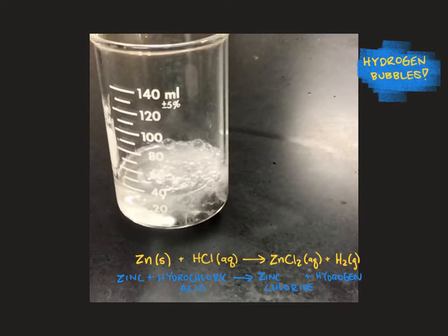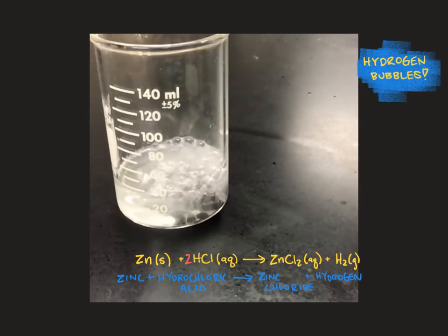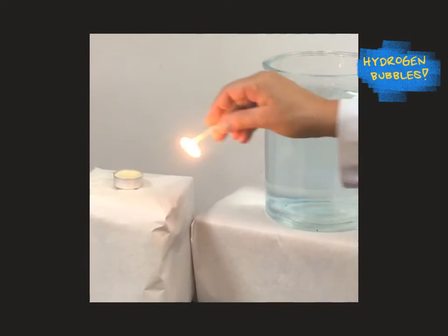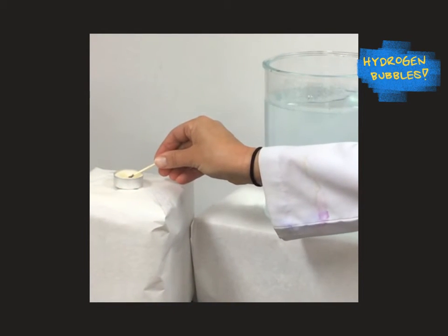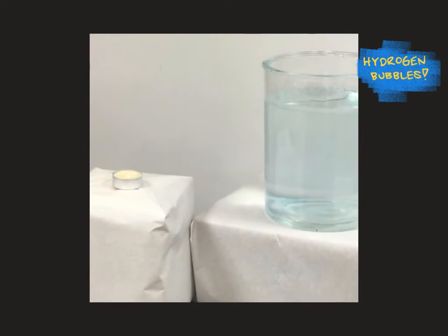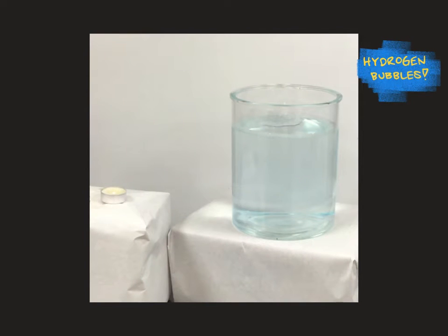Now, we're going to make use of the fact that this reaction generates hydrogen gas in a fun and clever way. Some of you might have seen a problem with hydrogen in the past, and that is that hydrogen gas is highly flammable. If you think back to some of your history lessons, some of you might have come across a particularly unpleasant event involving hydrogen, which was referred to as the Hindenburg-Zeppelin disaster. In that disaster, a very large blimp filled up with hydrogen gas ended up igniting and exploding in fairly spectacular fashion. We're going to do that reaction on a much, much smaller and safer scale here.